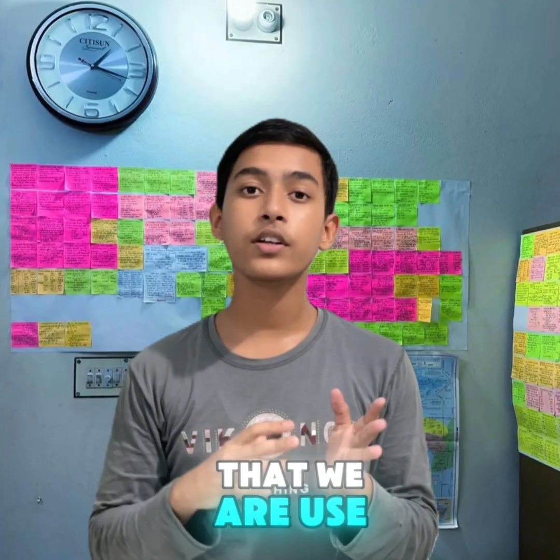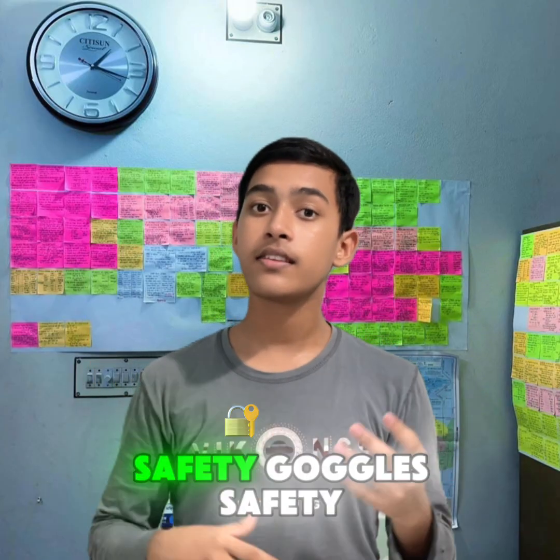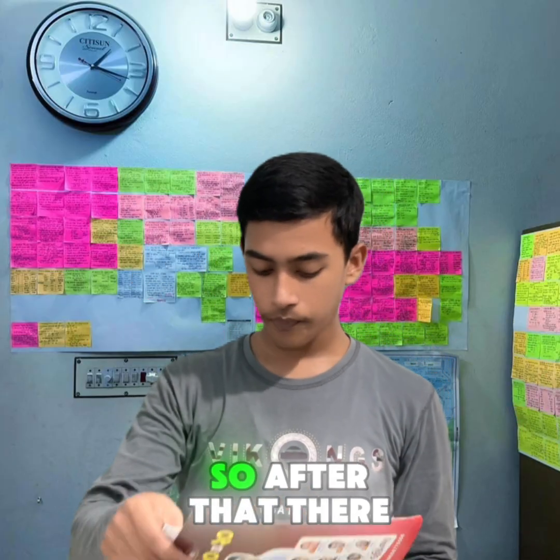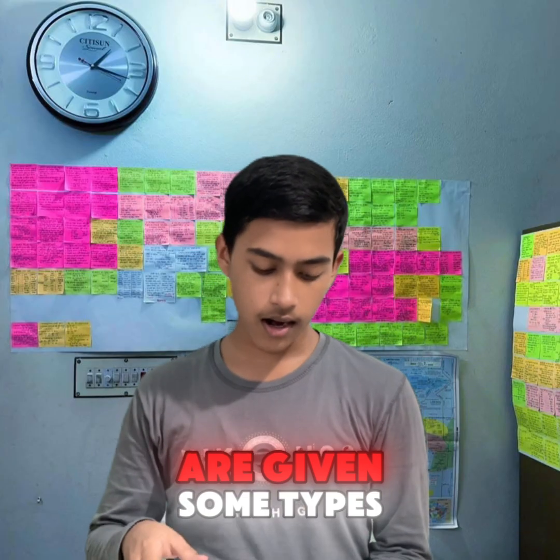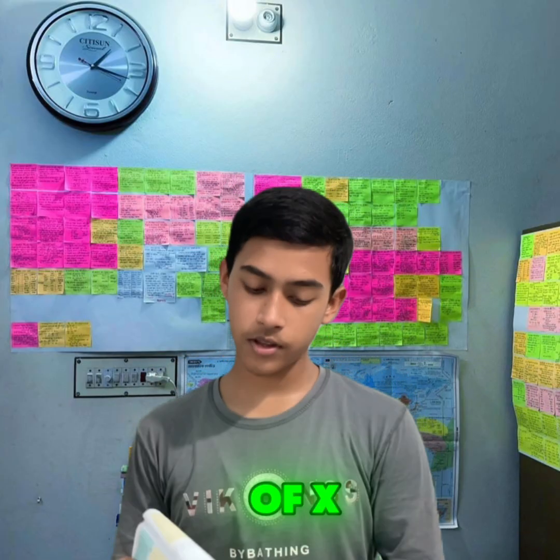So we must ensure that we use hand gloves, safety goggles, an apron and a mask.